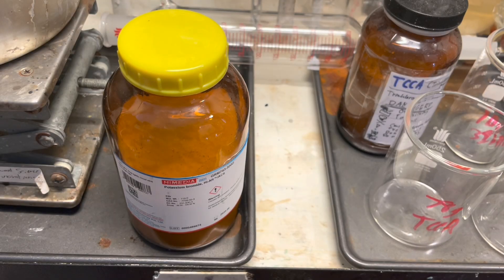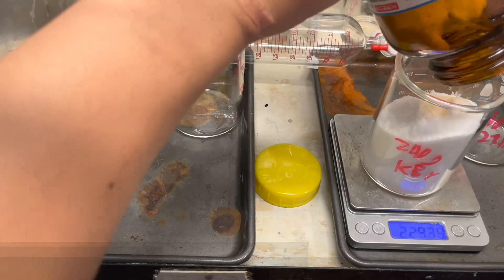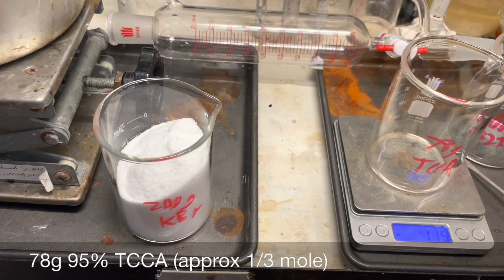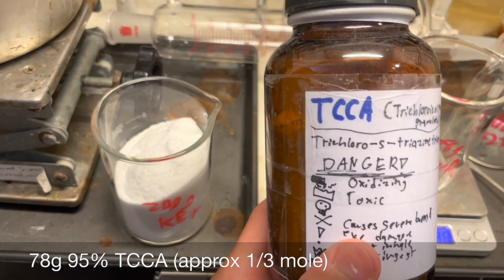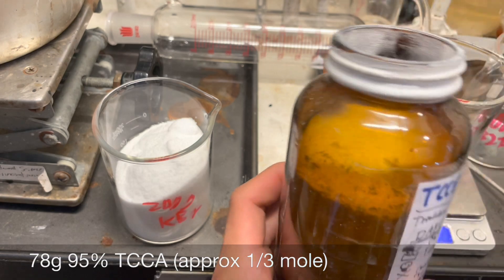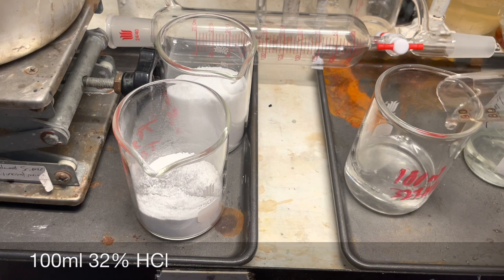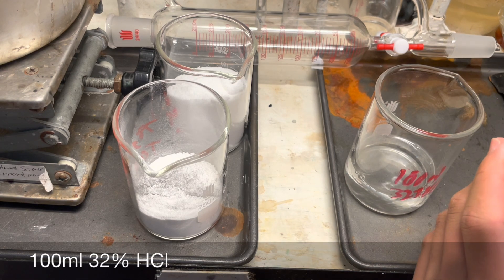So let's measure our reagents. The first thing you have to do is get your potassium bromide. Next we need 78 grams of trichloroisocyanuric acid, which is sometimes also called trichloro-s-triazinetrione. This is some pre-powdered stuff. Here I am measuring the hydrochloric acid. You can see a tiny bit of fuming in air - that's expected, because this is fairly concentrated.